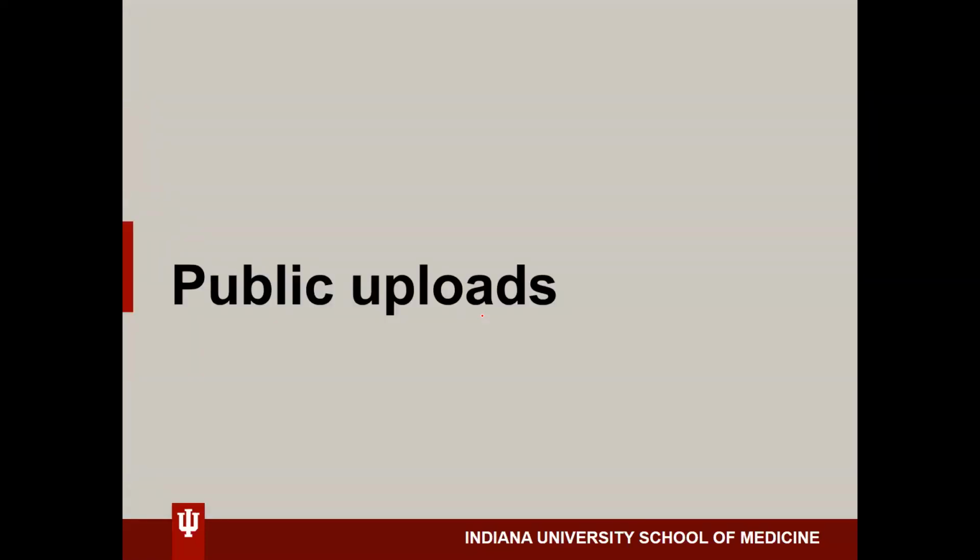So, okay, you have your raw files. Maybe the core has given you some output and you've written your paper and you would like to submit it, but it is getting really important that your data become publicly accessible. And in the past, this was a challenge, mostly because a lot of the mass spec files are very large. And so until relatively recently, there wasn't a great solution for making data easily publicly accessible. You're taking up so much storage space with all of your different files.